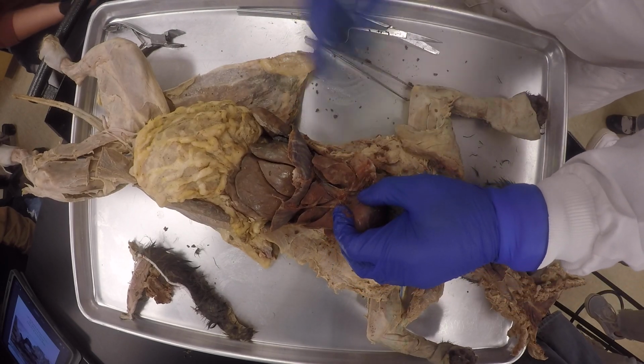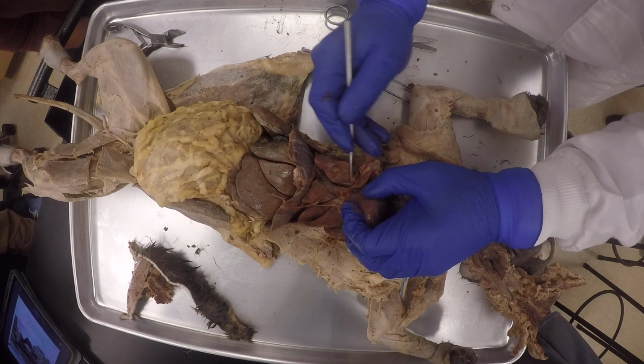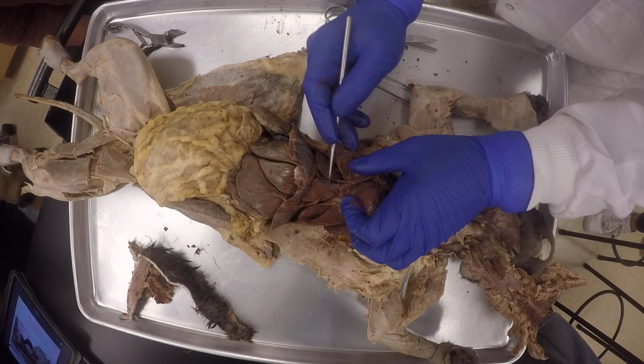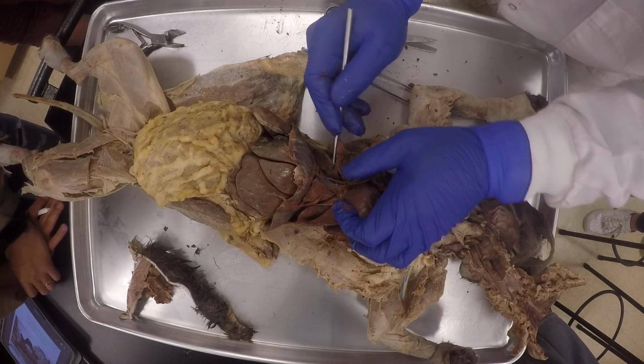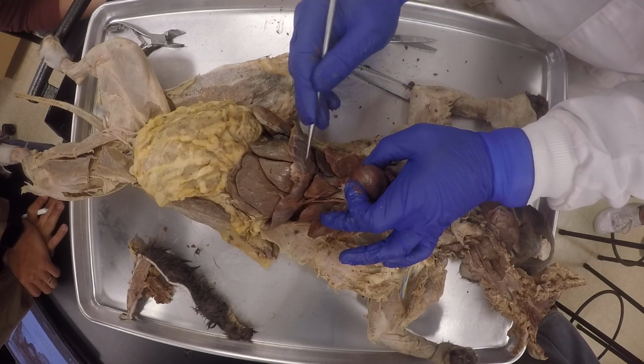So you see my phrenic nerve right there. Yeah, it goes alongside the inferior vena cava. The phrenic nerve is this one, and this is a vein, the inferior vena cava. And then there is the right phrenic nerve. It goes on both sides, and then it innervates the diaphragm.